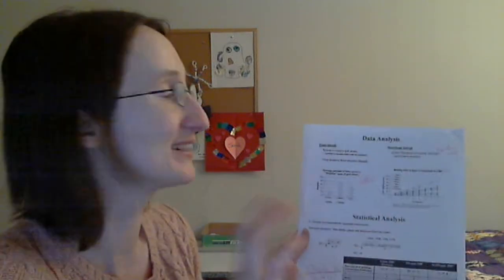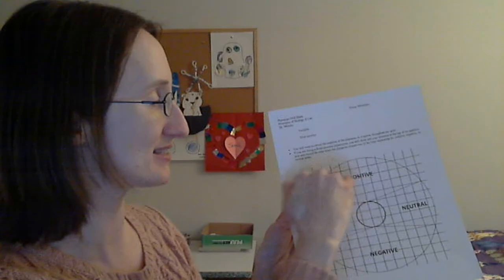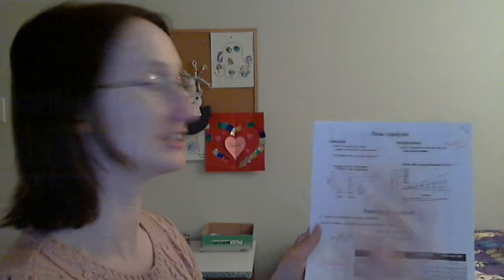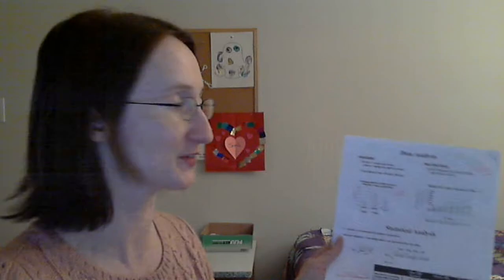Again, it sounds technical. All they did, if you look at that article, is they had a grid sheet very similar to this, and they counted how many times the worm crossed one of the walls, one of the grids. And that's their measure of how active the worm is. So if the worm is just sitting there still not doing anything, it's going to cross maybe 10 lines. If it's super active, maybe it's going to cross 40 lines. And so this is a way to quickly measure how active the worm is, how many grid lines it is crossing. So again, that's a very simple way to get good data if you're using a non-fixed stimuli. Again, if you don't like either of those, there's some more in the lab manual you can choose from.